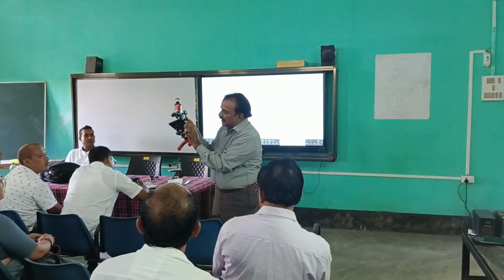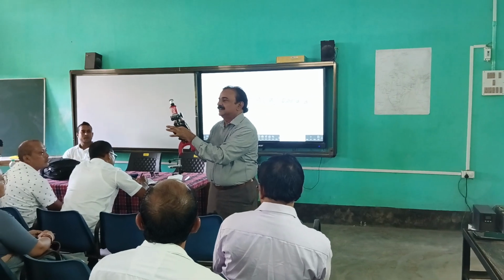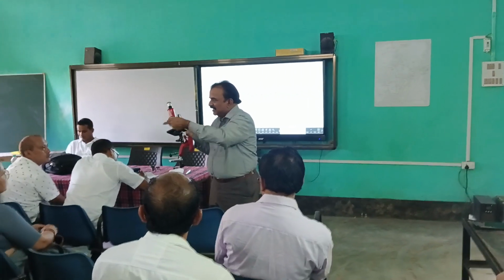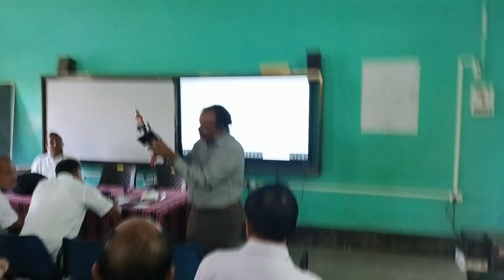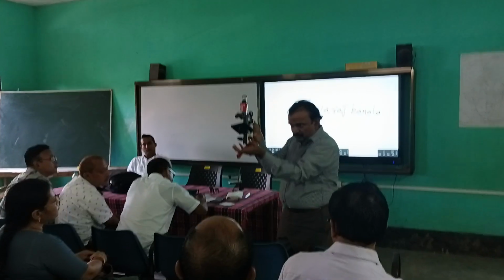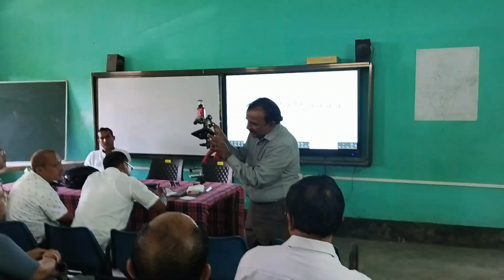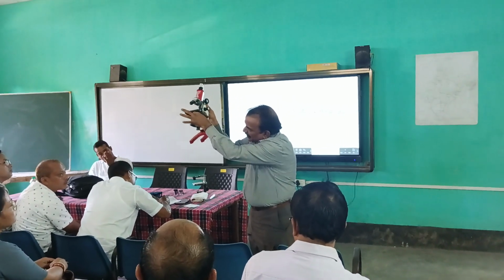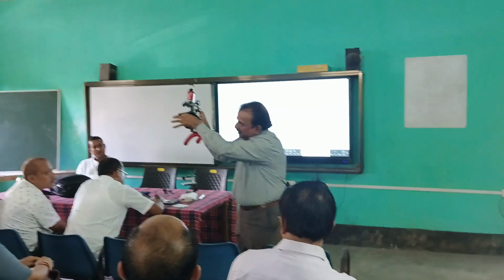There you see, this is called a lever. You know a lock; a lock has a key. Friends, you have a lever. At the time a company gives this microscope to you, you see the diaphragm. This is the diaphragm. It is closed. It is always in the closed condition, and you need to open it. Then only you can see.